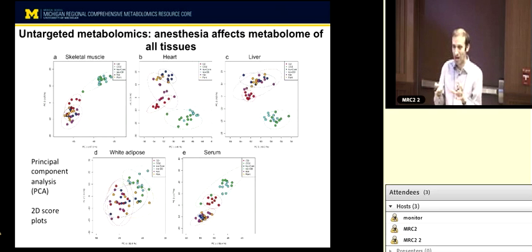So instead of trying to look at one metabolite, then another, then another, then see what changed, we say, given the global profile of the data, how does group A differ from group B, or condition A differ from condition B? And it breaks the data down into these principal components, which are abstractions, which define axes of change in your data.